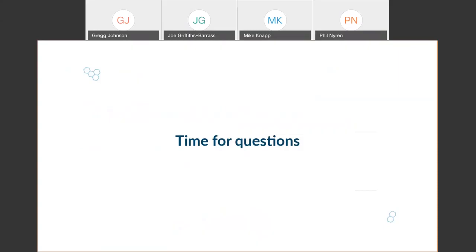Yeah, thanks a lot for that presentation. I really enjoyed it. So yeah, there have been questions coming in, so I'll just start with the very first one we had here. For the upstream cell culture process, low shear pumps are recommended. Are there any types of peristaltic pumps that cause less shear than the centrifugal or diaphragm pumps?